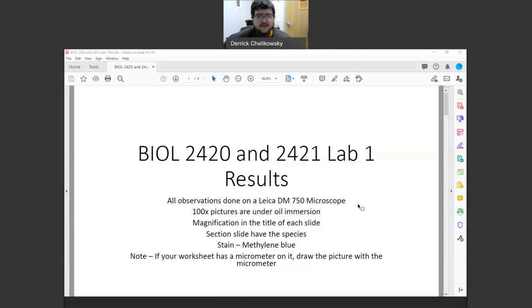The goal of this is to show you what you'll be seeing on your results PDFs, and then how to go about answering the questions associated with the exercises that we have you doing. So the first thing I want you to take a look at is, this is our drop page.